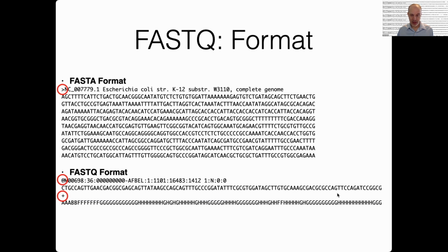And the same for the quality score. But there is the option within the FASTQ format to actually truncate the lines and wrap them, just like the FASTA format. And so sometimes people assume that FASTQ format files will not be wrapped onto multiple lines, and that is not a correct assumption. Again, not something you need to worry about unless you are actually writing code to try and parse a FASTQ file.